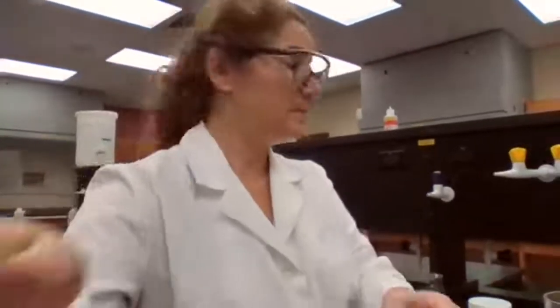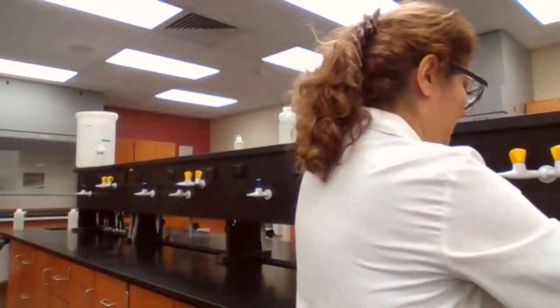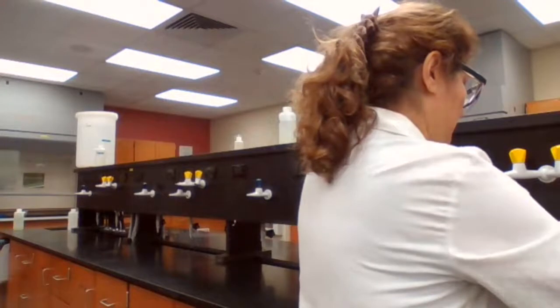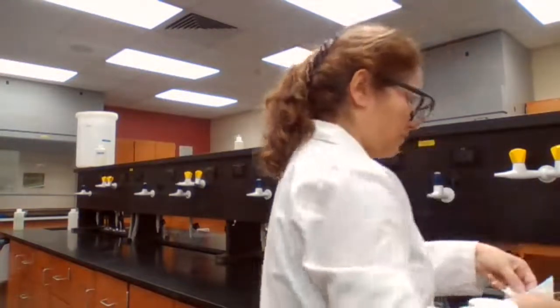I got 0.202 grams. Going to add it to a flask.